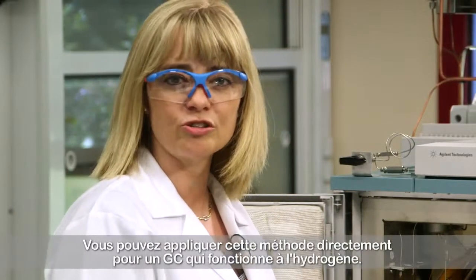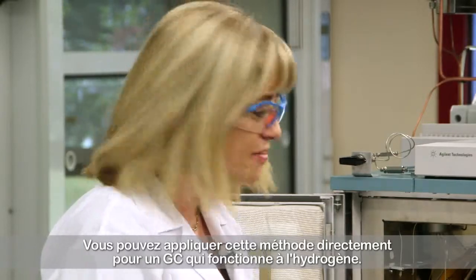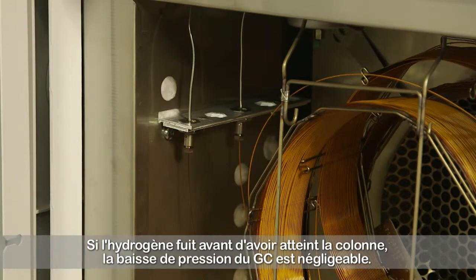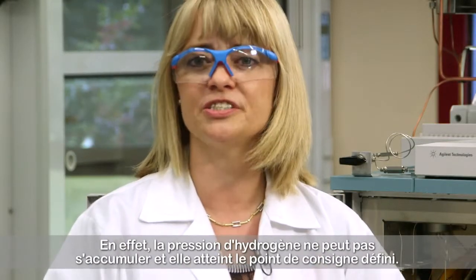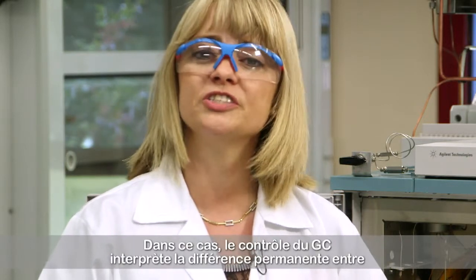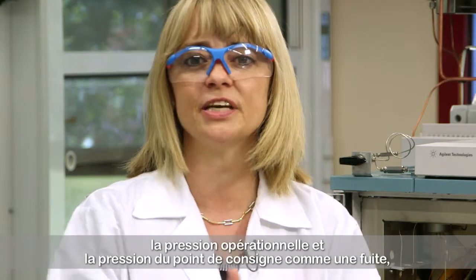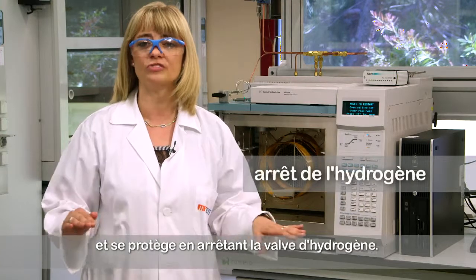This can be directly used for a GC working with hydrogen. If hydrogen leaks before reaching the column, the pressure drop of the GC is negligible. Hydrogen pressure cannot build up and reach the defined set point. In this case, the control of the GC interprets the permanent difference between the operative and the set point pressure as a leak, and protects the GC by shutting off the hydrogen valve.